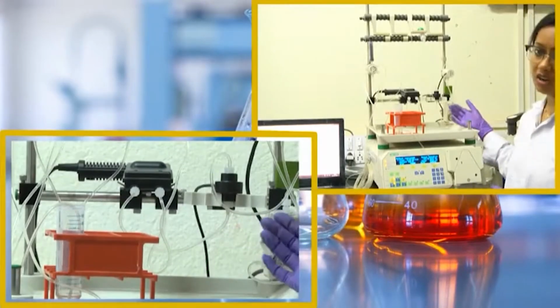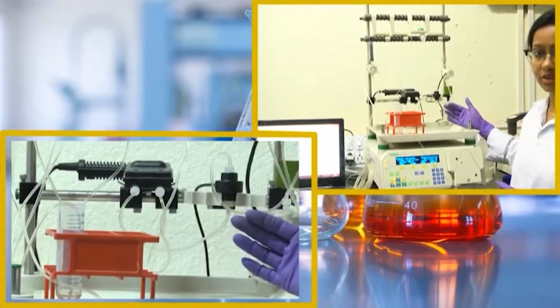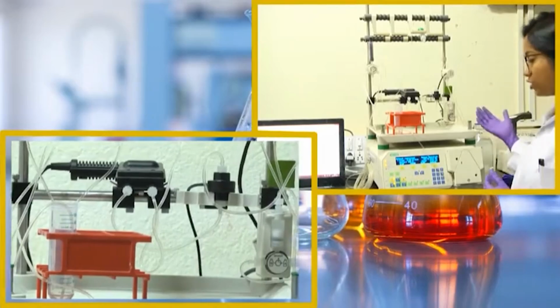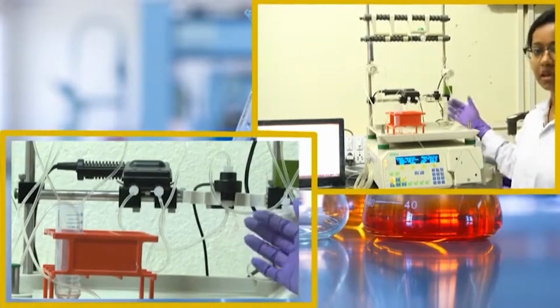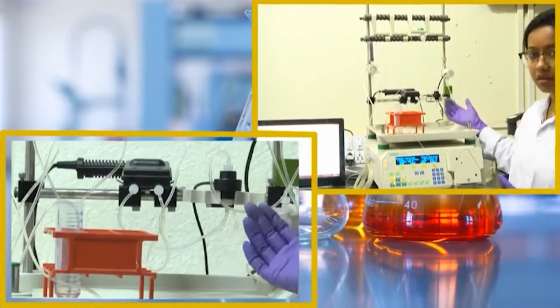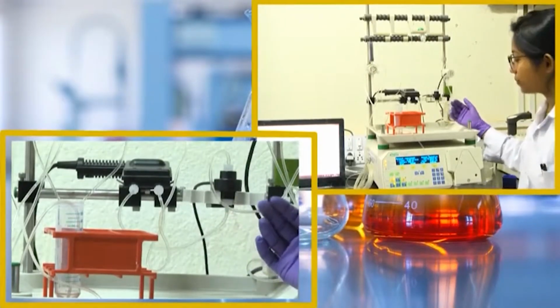The cleaning of the column and the machine is different, so always make sure what cleaning you are doing. If HCl has to be passed through your tubings, you cannot pass it through the column. So, always detach the column beforehand and clean the FPLC system, and then while cleaning the column, you can attach the column again and clean your column as well.